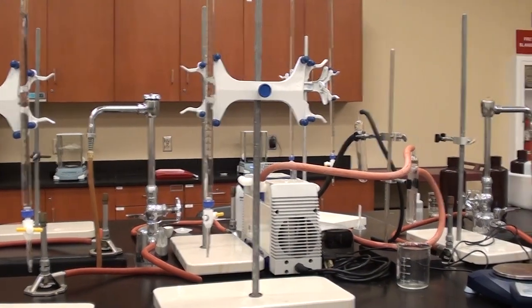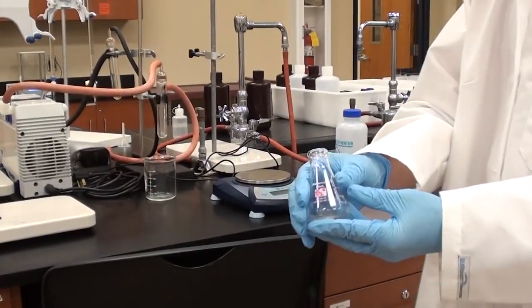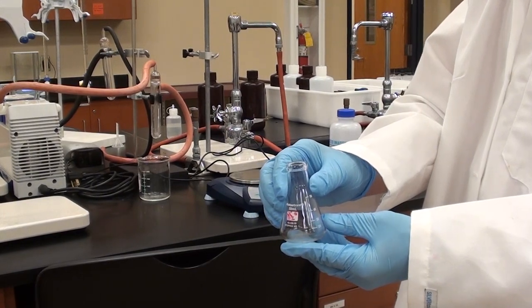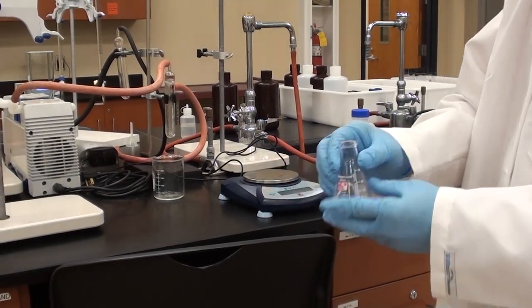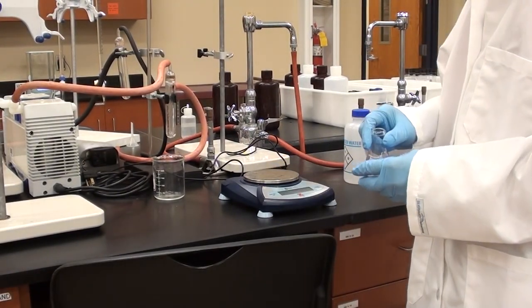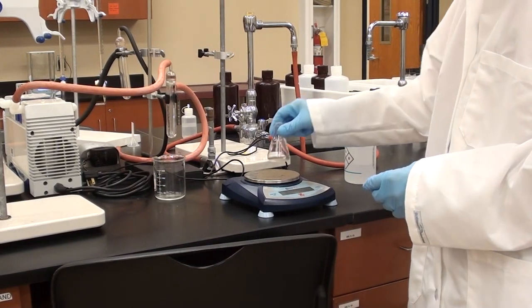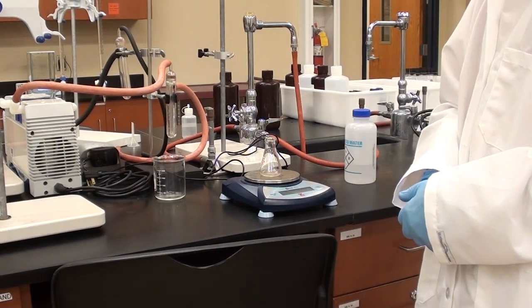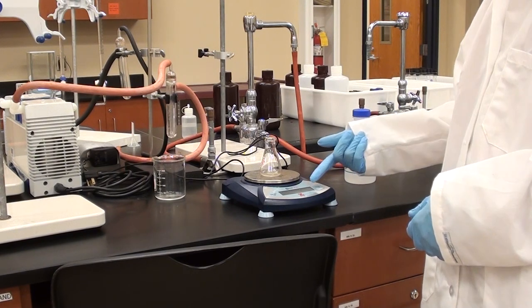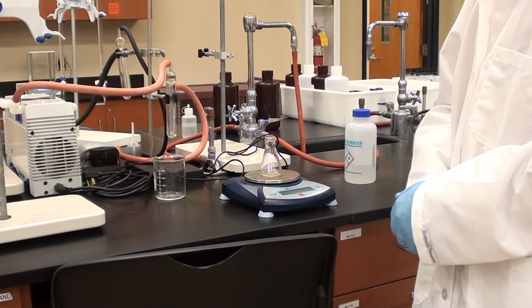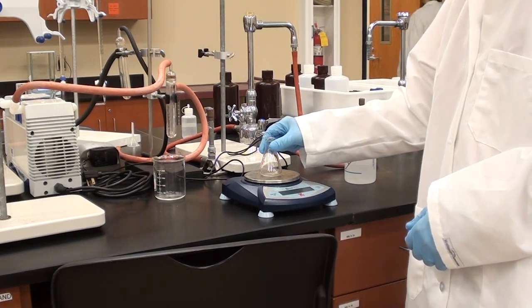And what we're going to do first is weigh this 25 or 50 milliliter, in this case, Erlenmeyer flask. So he's zeroing it, he's putting it on, and he's going to measure to all of the available decimal places. All right, so we've got the initial mass now. That's great.